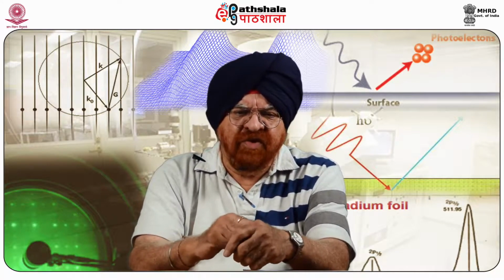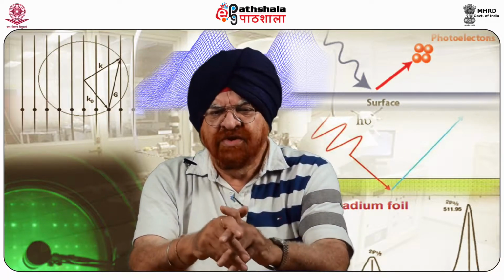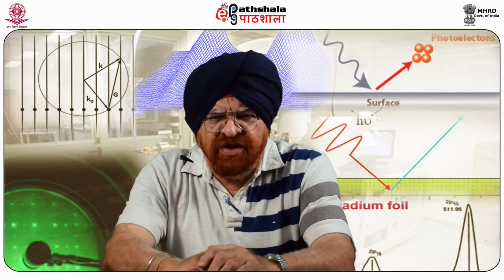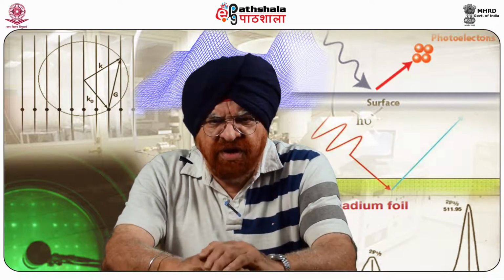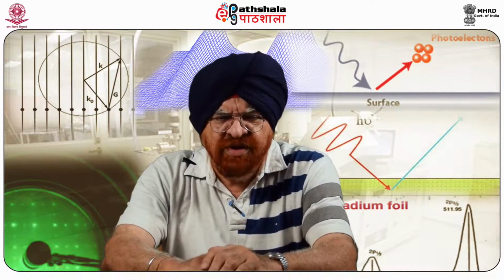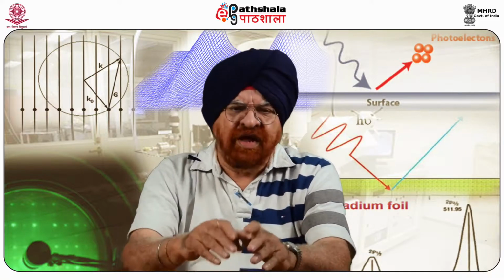Then the empirical formula of a material can be found out, which is a big help to the analyst. The chemical state identification can be done very accurately, and local bonding of one or more of the elements in the sample can be very precisely calculated.